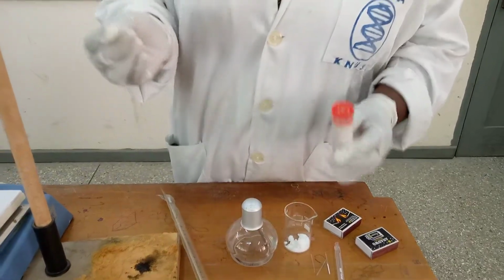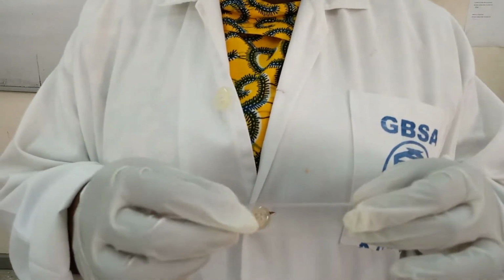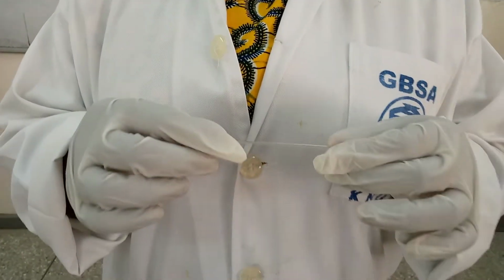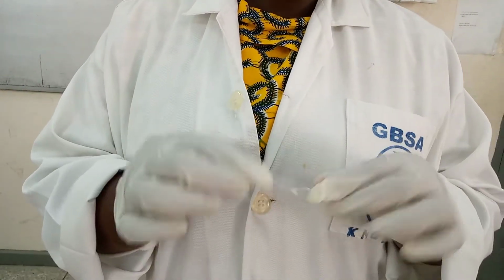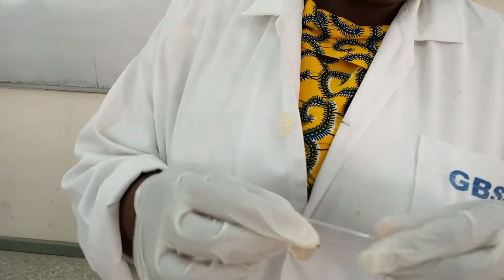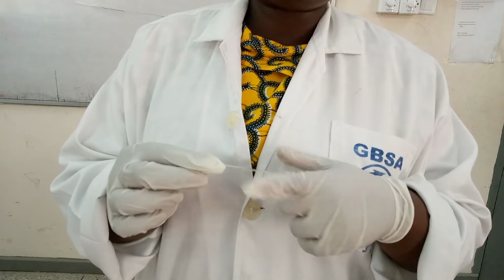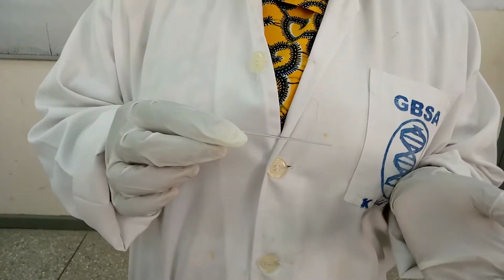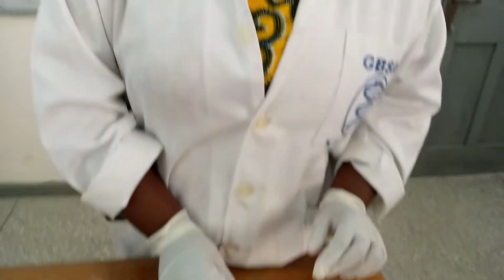Now this is how the capillary tube looks like. In my first video on identification of glass rods, I talked about capillary tube. So this is how it looks like. Both ends are open. Now, if we don't close one end and we start filling our sample, it will come out. So we have to seal one end. So I'm going to demonstrate how to seal this.